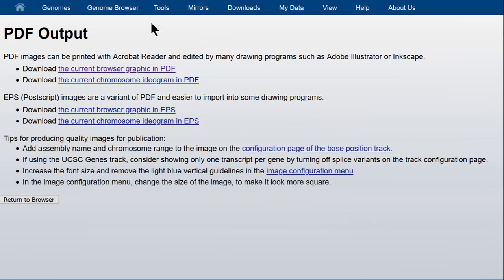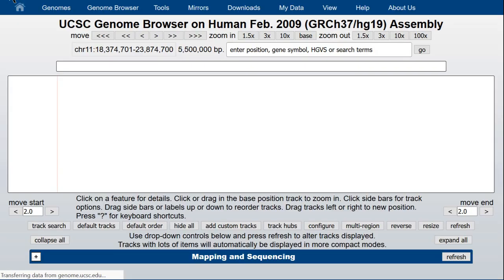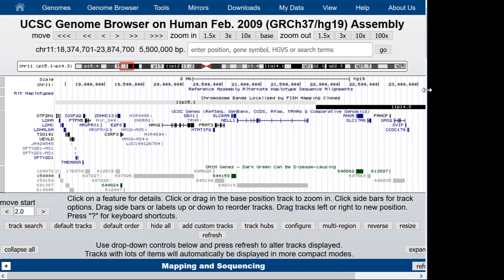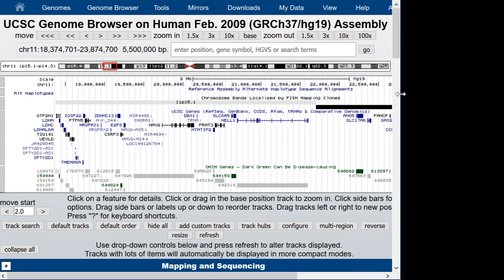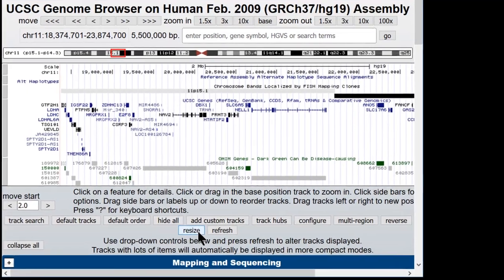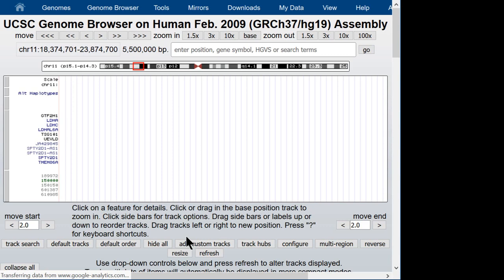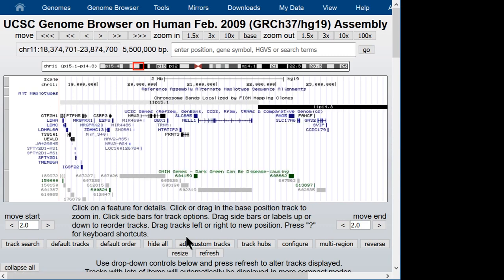Going back to the browser graphic, an interesting feature is that if you wanted to save an image that wasn't quite as wide, the browser will redraw the screen if you shrink the size of your Firefox or Chrome browser window and make it a little narrower. There's a Resize button below the browser graphic which lets you choose the size of the window, and then your graphic is redrawn to fit the window with all the annotations on the screen, so the type won't be misshapen if you resize it asymmetrically.